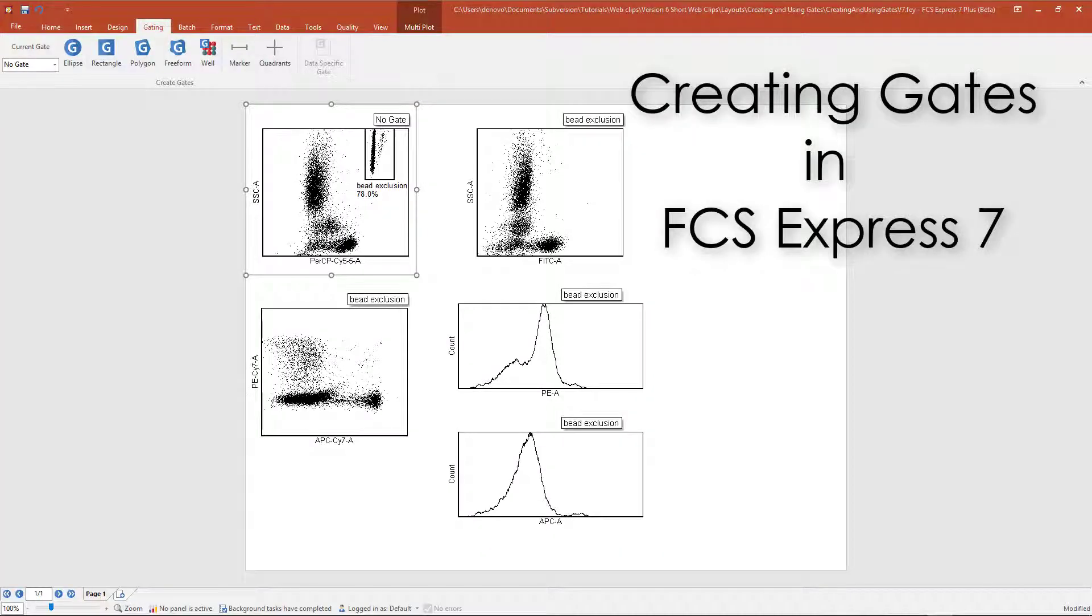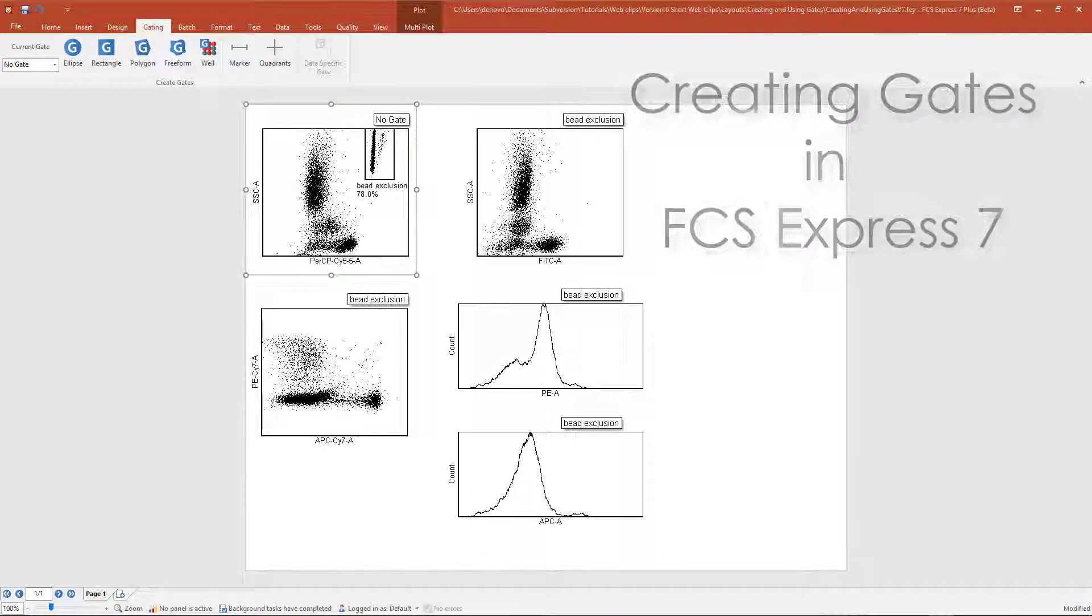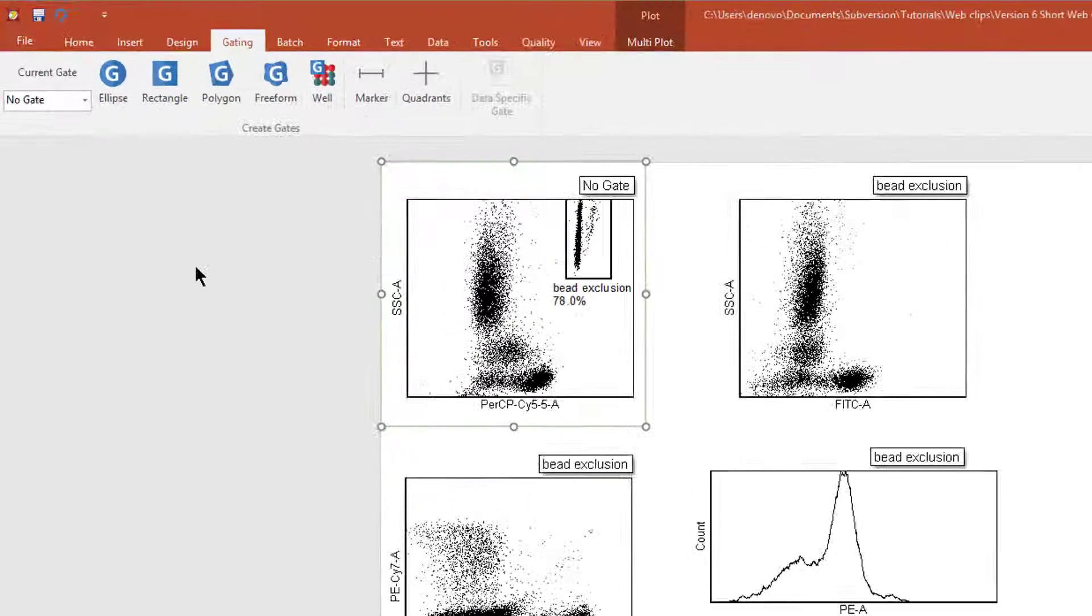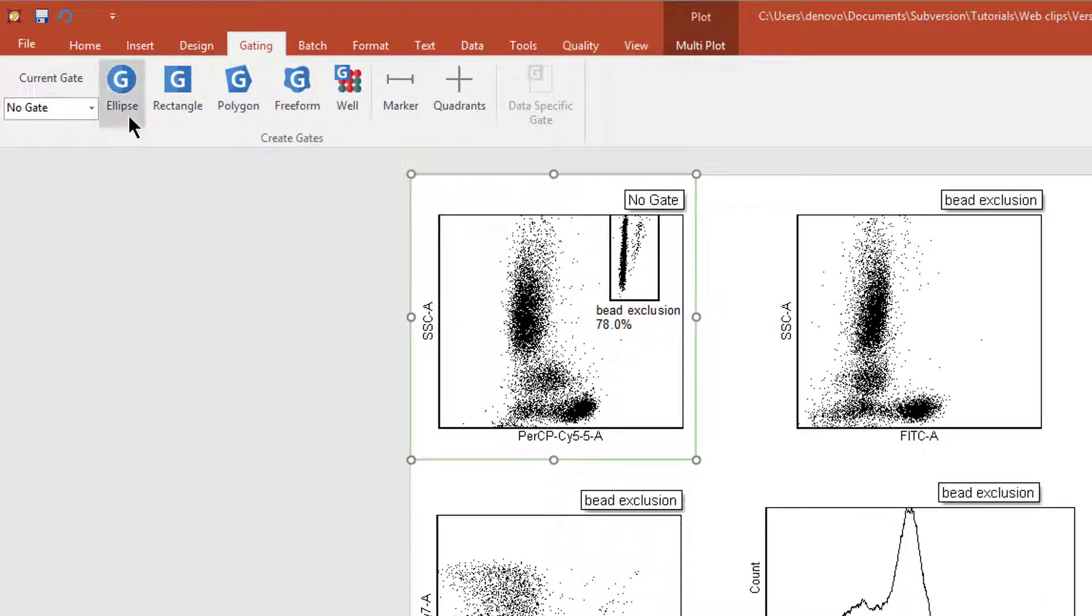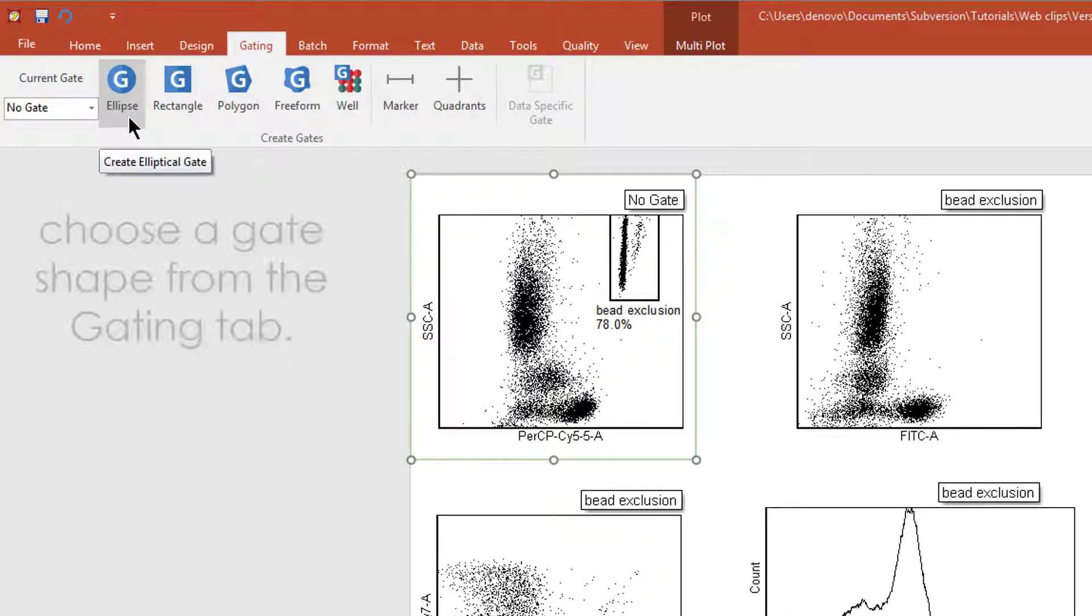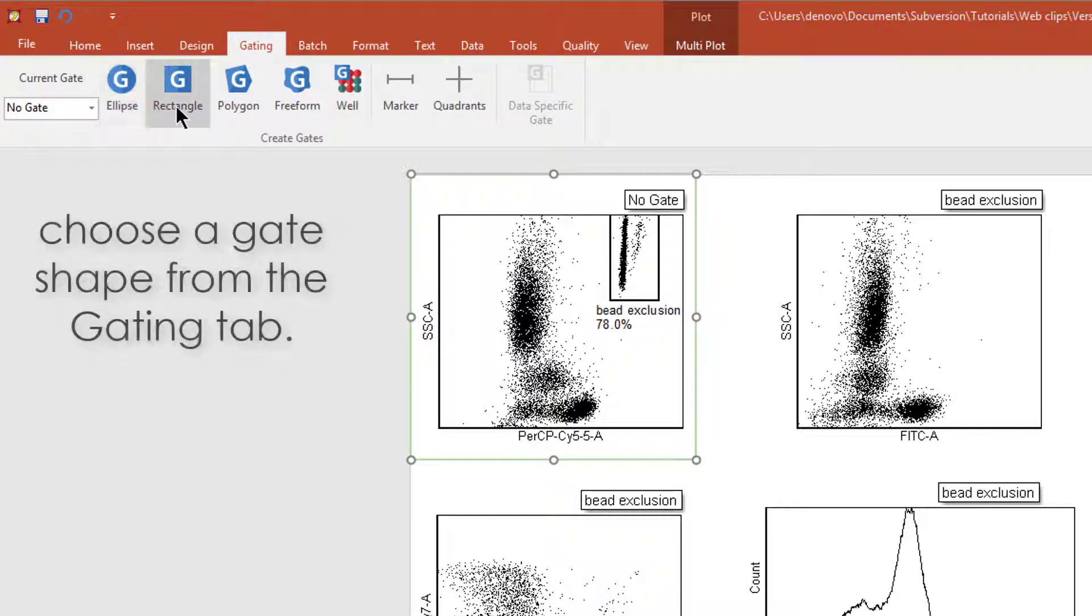To create gates in FCS Express, go to the Gating tab. There are several kinds of gates available, including ellipse, rectangle, polygon, and freeform.